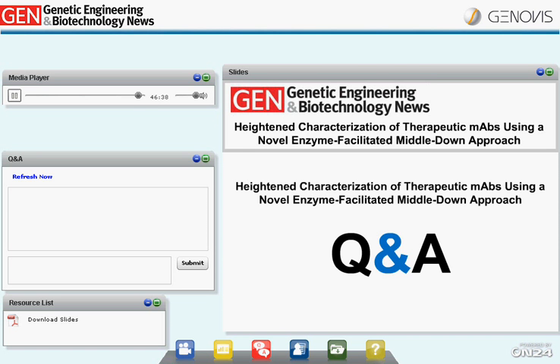Right, and can you give an example or name of a protein that was characterized using FabRICATOR other than the mAb? Yeah, sure. We know that it has been used, for example, for Enbrel-type Fc fusion proteins, in characterizing or mapping glycan sites on Fc fusion proteins.